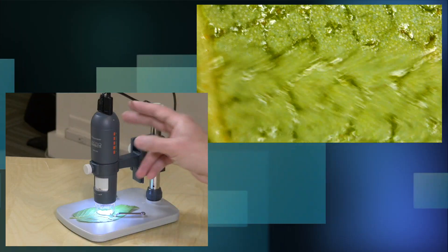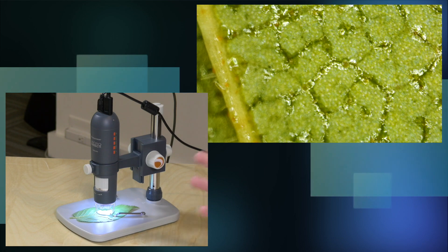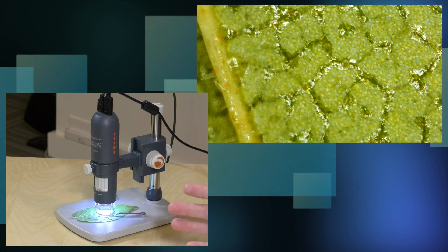It looks like they accounted for the fact that you have to touch the microscope to take a picture. So if I go over here to fire off a picture, you can see that I jostled it when I pushed the button in, but the frame did not get captured until it settled down. It looks like they built in a slight delay to account for you pushing the button and the motion that might get picked up in the photo. It also supports time-lapse photos, so if you are studying something that is moving at a microscopic level it'll take a bunch of photos that you can then stitch together for a time-lapse video.